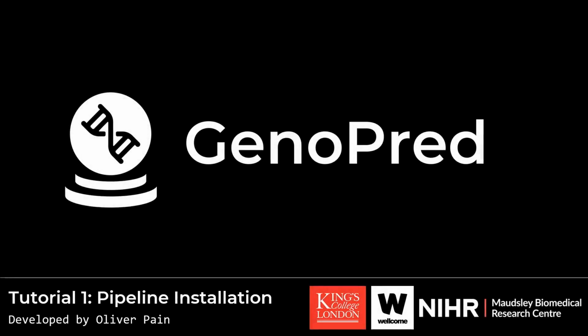GenoPred is an easy-to-use, scalable software pipeline developed at King's College London, which can be used to calculate polygenic scores. The software is part of a wider research program that focuses on key issues relating to the clinical utility of polygenic scores, investigating key polygenic scoring research questions, and developing tools that implement current best practices.